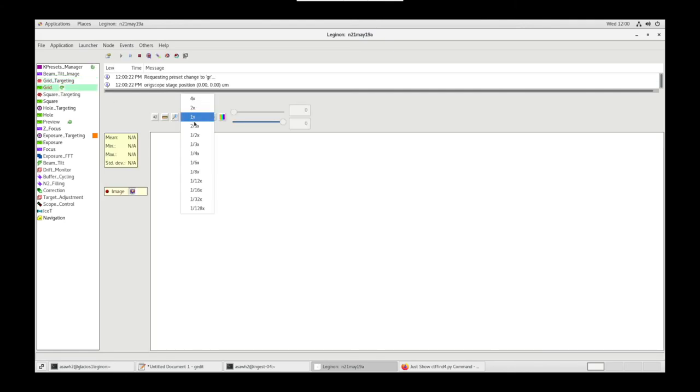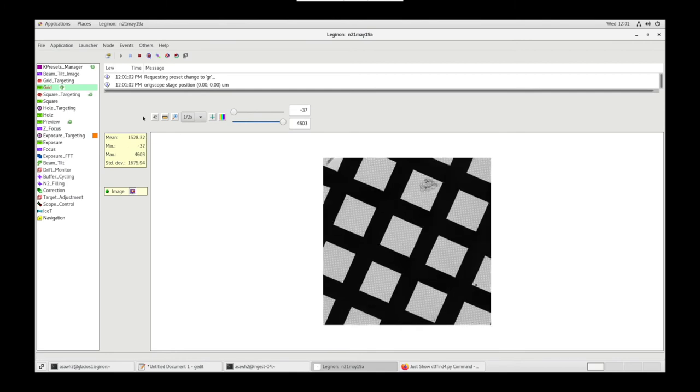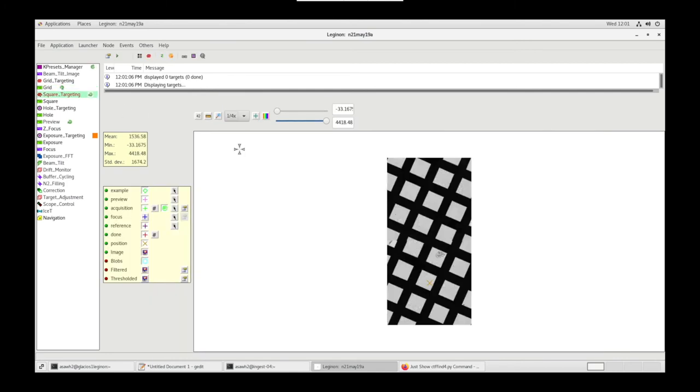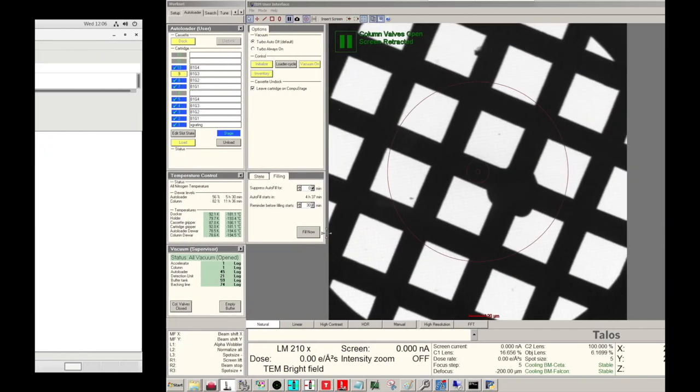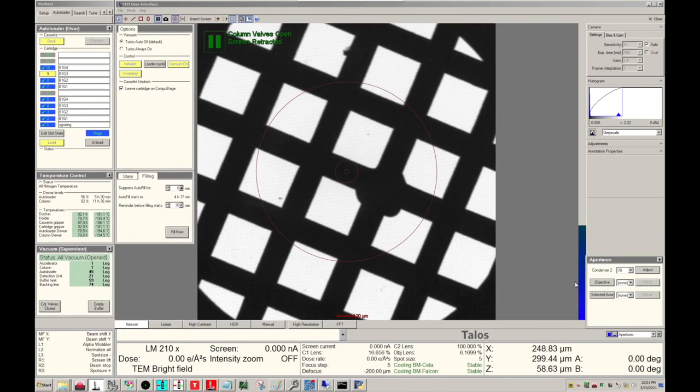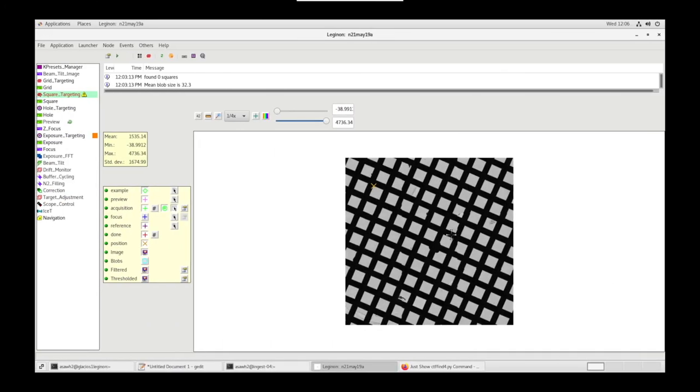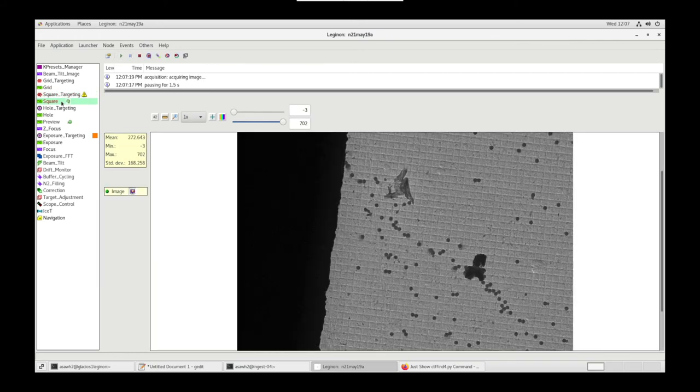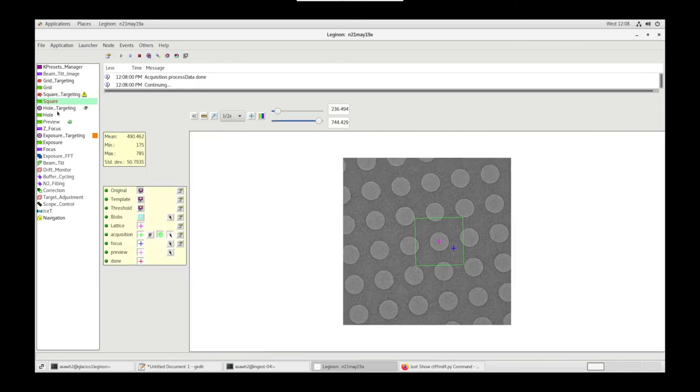If we go to the Grid node, we'll see our grid images taken here. And if we go to Square Targeting, we'll see all the grid images being stitched together into complete atlas. On the Microscope computer, insert the objective. Go back to Legenon. Place Acquisition Targets on squares of differing ice thicknesses. Submit Queue.